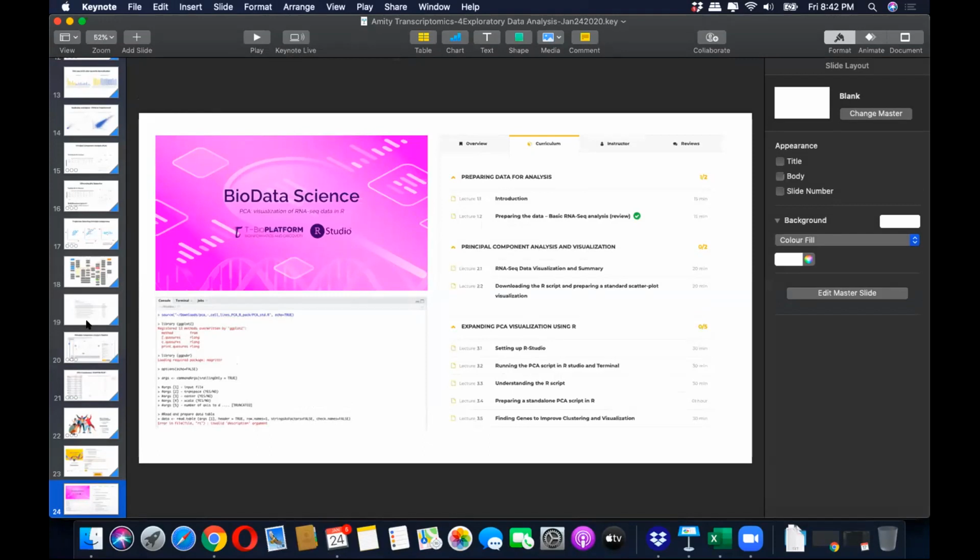So today we covered a bit. We looked into the gene expression, and we looked into the table of expression. Today we did some normalization, and also we looked into PCA and how PCA helps us in visualizing the data. So I think this was helpful for all of you to start doing something on the platform.